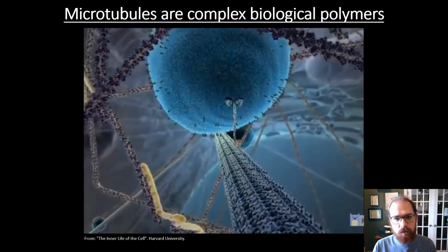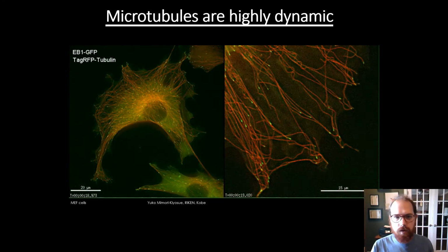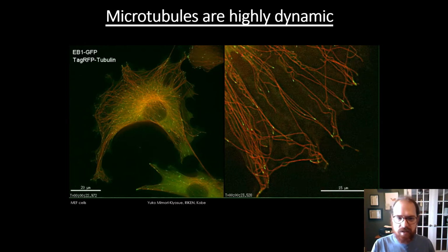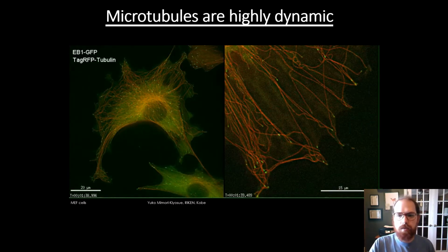It's really cool to see these little kinesin molecules walking along a microtubule. But they're used in a variety of cellular processes. As I mentioned, microtubules are highly dynamic, as we can see in these videos that show microtubules in red, and the green helps show the edge of the microtubule growing and shrinking spontaneously over time. And they form this dense cytoskeletal architecture or network going throughout the whole cell.